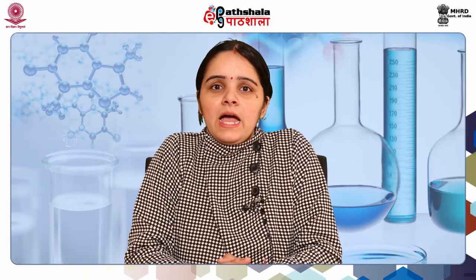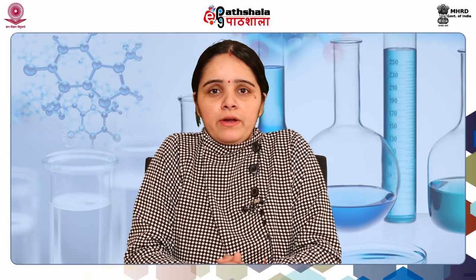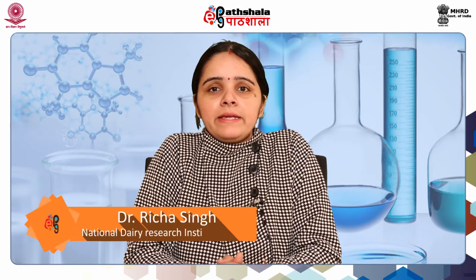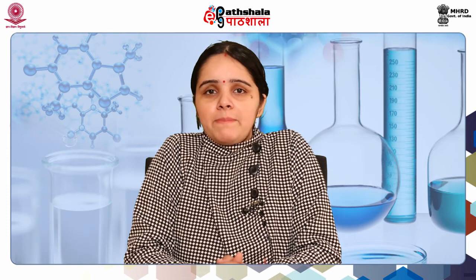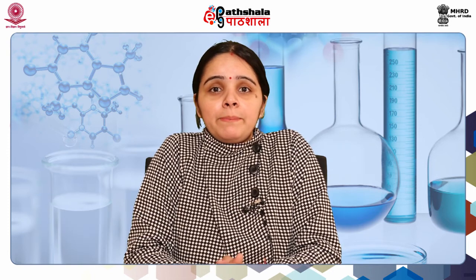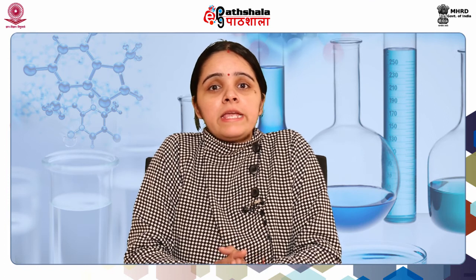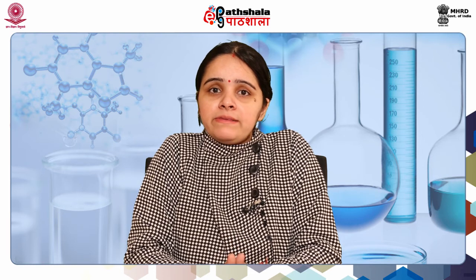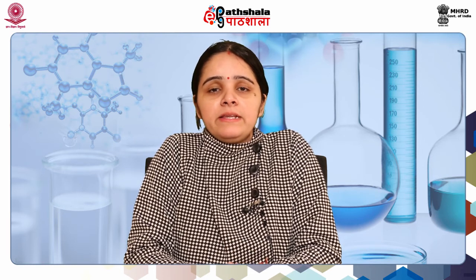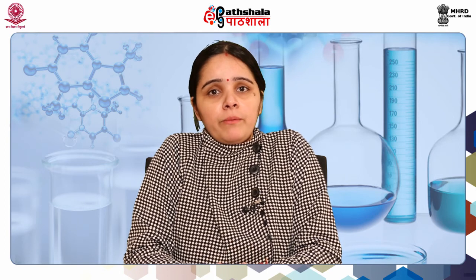Dear students, up to now we have covered the theoretical aspect of thin layer chromatography. Now we come to the practical aspect of thin layer chromatography, that means how it is performed on the bench. Now you have the prepared TLC plate, meaning that the stationary phase is already applied to the solid support. Now you take the prepared TLC plate, and with the help of a pencil you mark the TLC plate 1 centimeter from the bottom.